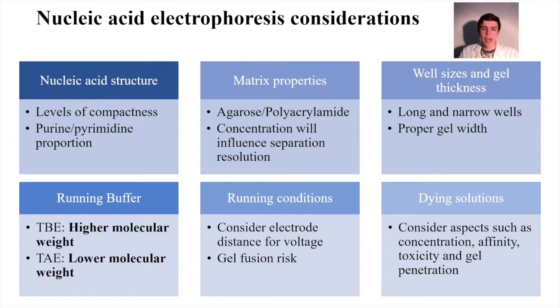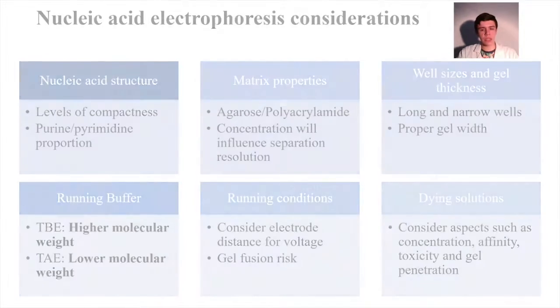Dyeing solutions. Aspects like the concentration, sample affinity, toxicity, and gel penetration must be considered, because this will be the compound that will allow gel visualization. The structural characteristics of the sample must be assessed for determining this consideration.